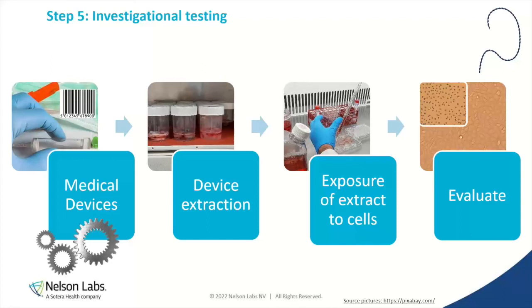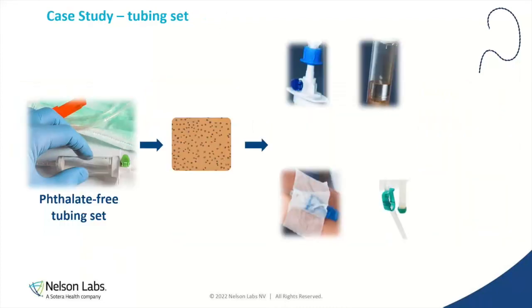So literature is not helping anymore. Change control checking is not helping anymore. The ISO standards with extraction conditions and so on. Now you really have to evaluate and see, do I see a difference in passing and failing in these different stages? So that is more up to you, and see what you can do depending on the device. And I think that's one case you had, Audrey, to discuss here to help them.